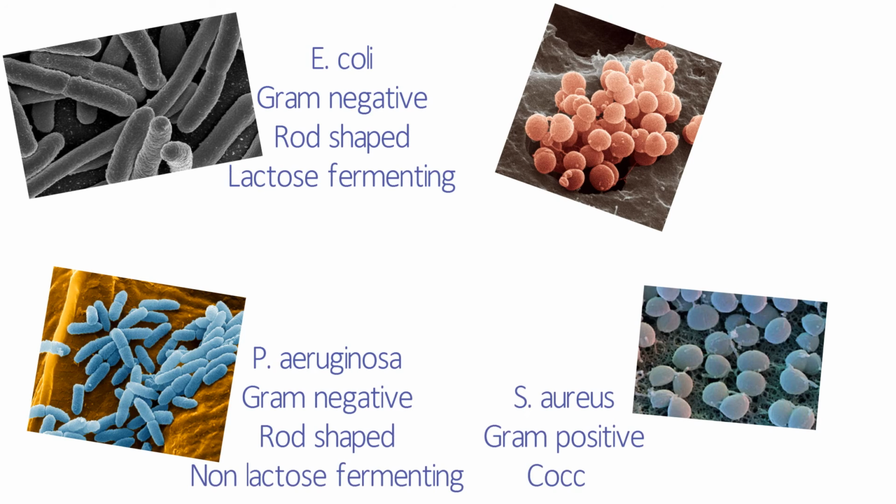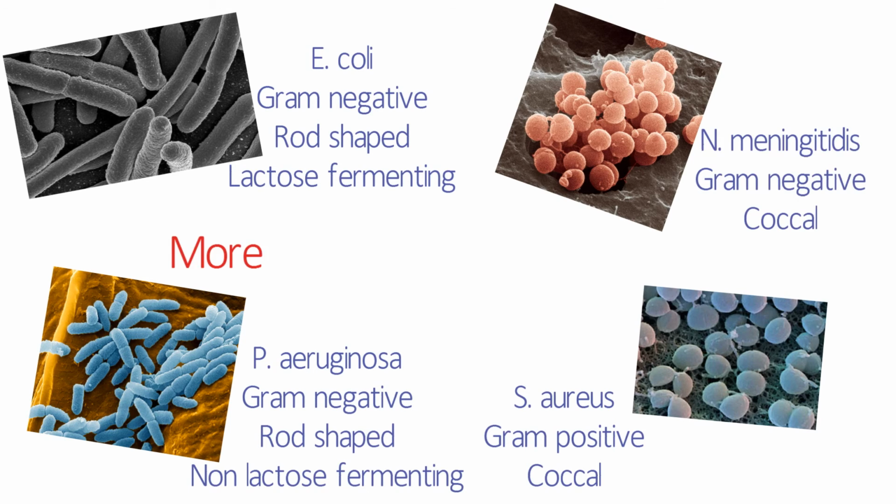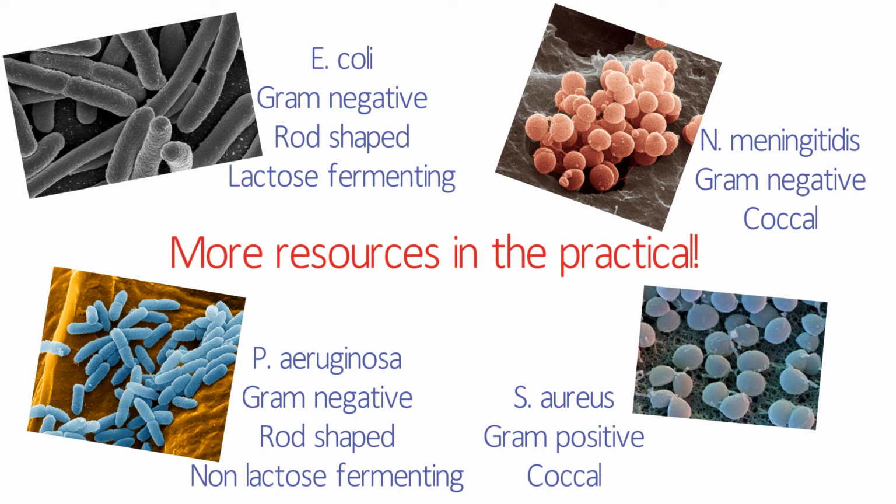Note that these tests wouldn't be enough for a definite identification in a hospital lab. If you were doing this for real, you'd also want to do some sort of genetic analysis, but these techniques will give you a pretty good idea of what the species might be.